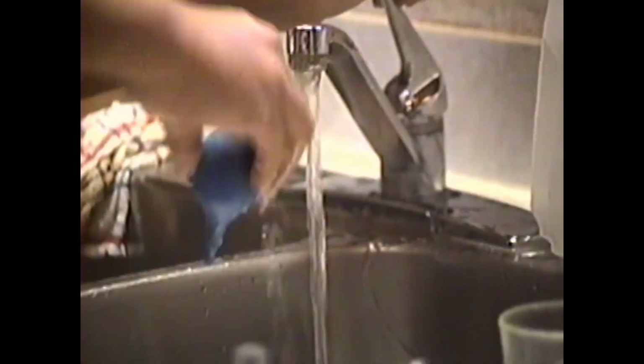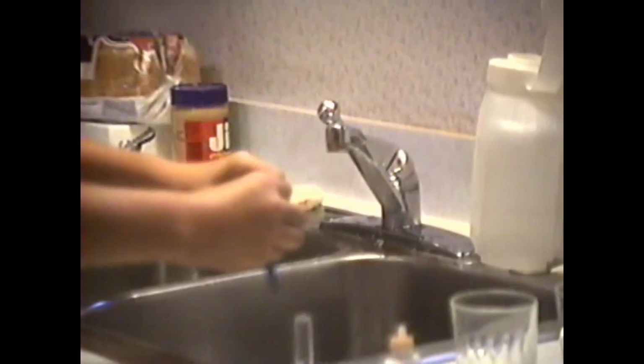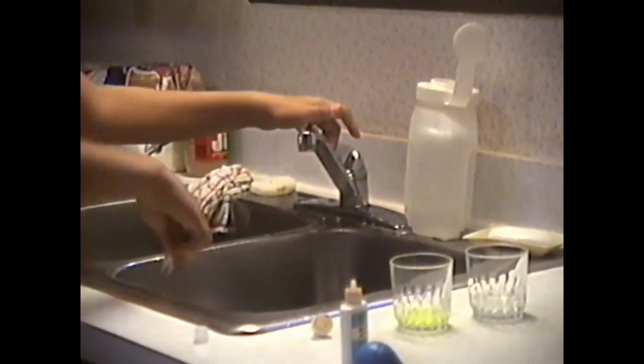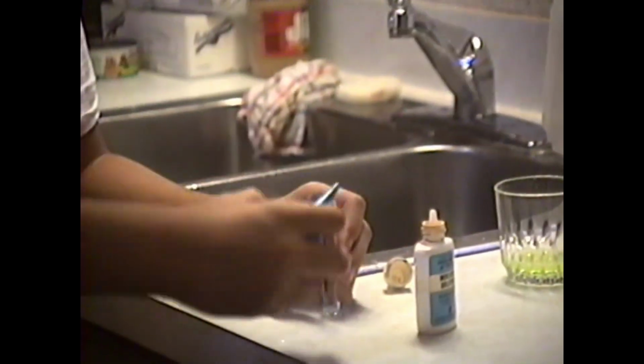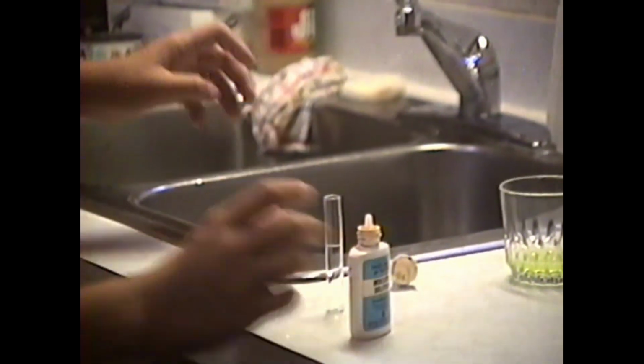Now, we're going to see if vinegar is acid or alkaline based. Take the vinegar out of the cup. Put 1, 2, 3, 4 drops of vinegar in. And fill up with water.